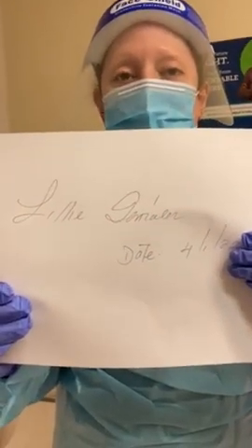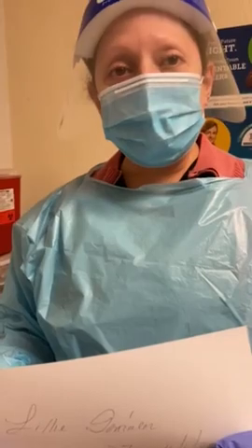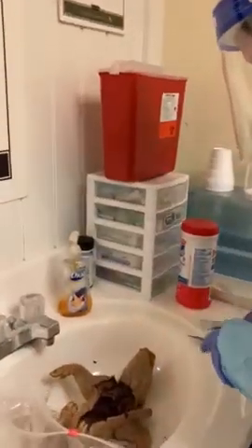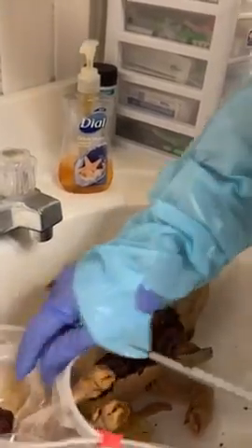Today is April the 1st, 2022, and this is my video presentation about the pig dissection. Today we will show the lungs. Here we have the pig. I started opening it already so we can save time.